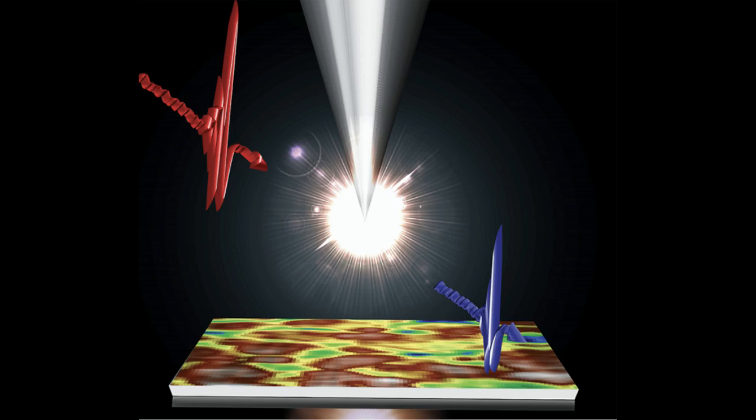Using this new microscope, the team investigated a perovskite material, MAPbI3, that has recently become of interest to scientists as an alternative to silicon in solar cells. Perovskites are a special type of semiconductor that transports an electric charge when it is exposed to visible light. The main challenge to using MAPbI3 in solar cells is that it degrades easily when exposed to elements like heat and moisture.